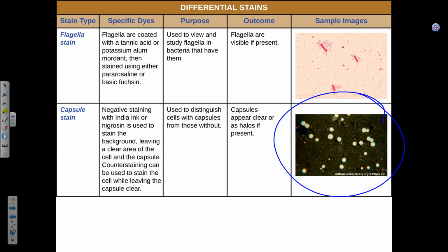So now, you may ask, oh, good God, what do we have to know about the staining? About these various methods? Well, you have to understand the idea of simple versus differential. That's one. You have to understand the idea of positive versus negative staining: which one will stain cells, which one will stain the background. You have to understand those. What did we count? Five basic types of differential staining: Gram, acid-fast, capsular, endospore, and flagellar. So five types.